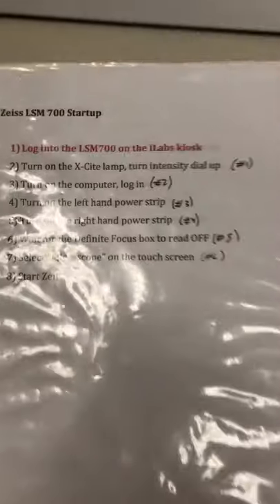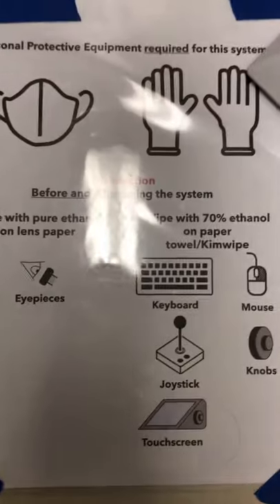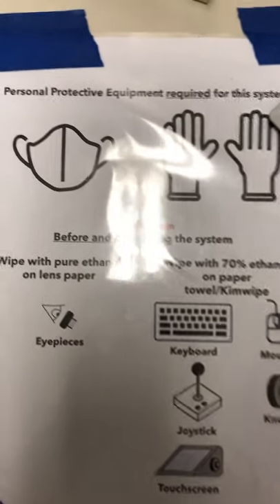Startup instructions for the system will always be somewhere in the room. These are the standard startup instructions and we'll go through each step one at a time. Over here are the new procedures that are designed to preserve your safety while you use the system.